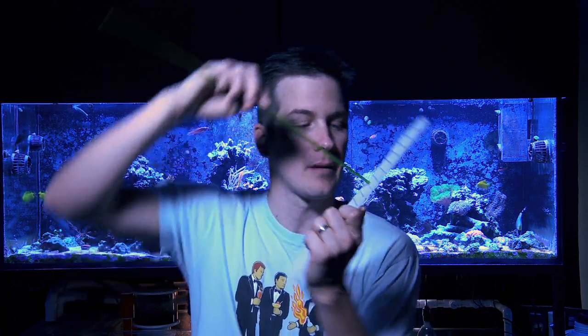Way number one, you do what Drew does. Grab yourself some egg crate and some rigid airline tubing. Cut down the airline tubing so that it's slightly longer than your test tubes, and then glue it into one of the corners of the egg crate. Invert the egg crate and you have a nice test tube drying rack.